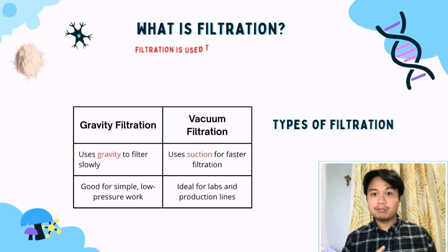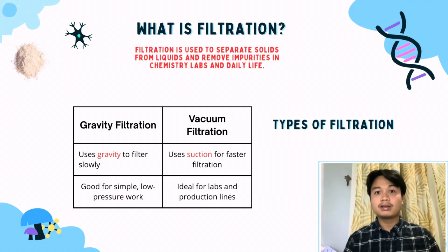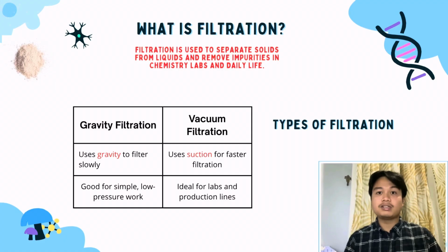Hi everyone, I'm Arman, and now we are going to talk about filtration. Filtration is a technique that's more important than it seems. Filtration is simply a way to separate solids from liquids. It helps remove unwanted particles or impurities from a mixture. We often use it in chemistry labs, but guess what? It's also something we rely on in daily life, like when we filter water before drinking it.